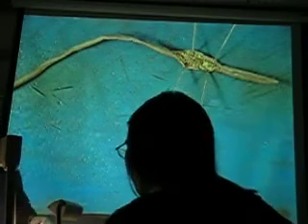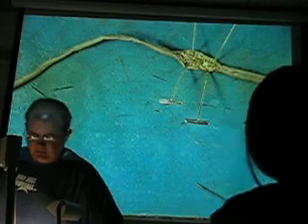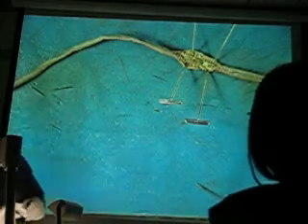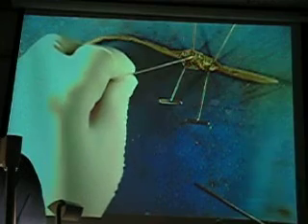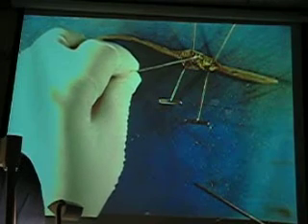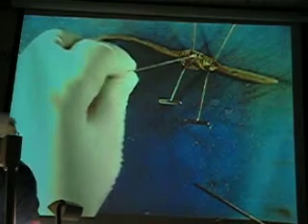Earthworm. Alright, so far we don't have anything, but I can point to a couple things. I just kind of opened an arbitrary spot and you see these little dividers here. Those are septa and this little mucoid-like thing there is a nephridium.